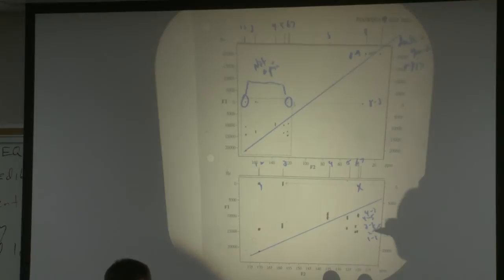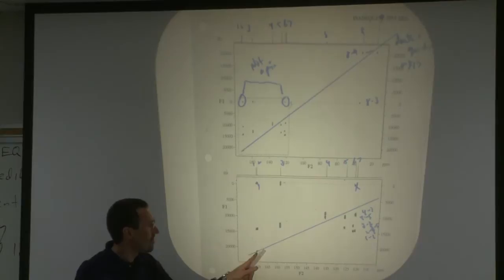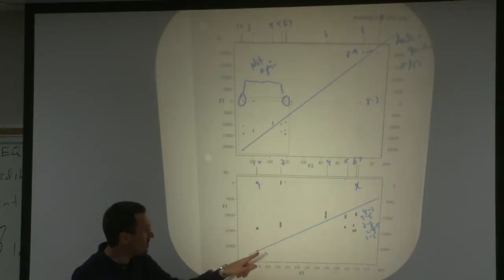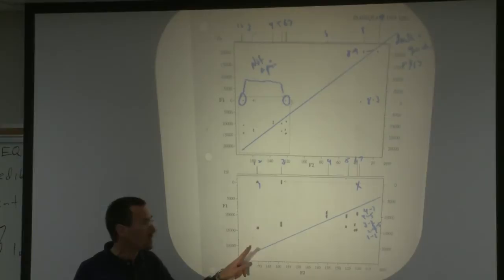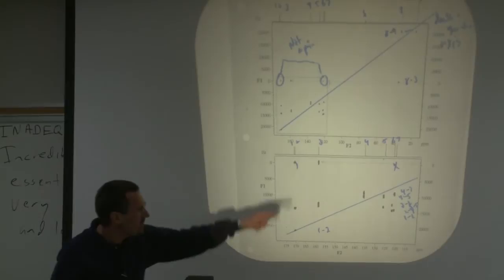And then what's going on over here? That's got to be a 1-2 pair. If 1 and 2 weren't giving a cross peak, you wouldn't see a spot here. So even where they're really close, we're seeing a 1-2 cross peak. So you're all set to go ahead and tackle this on your own.